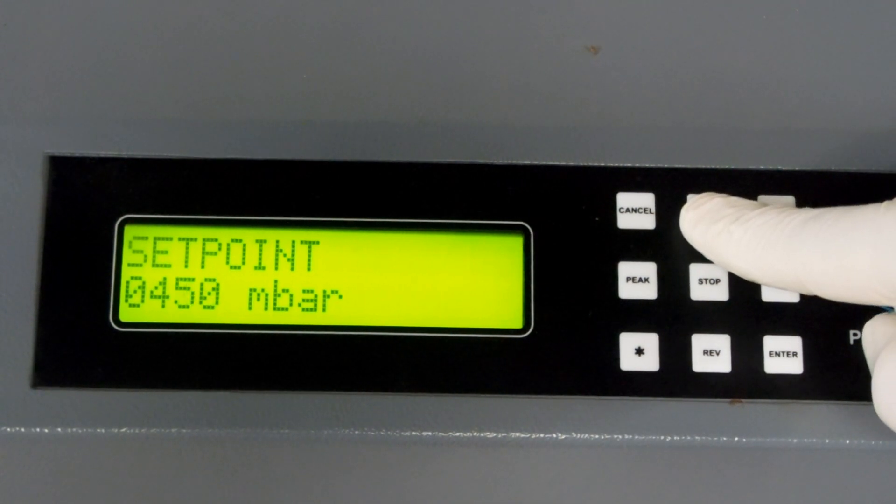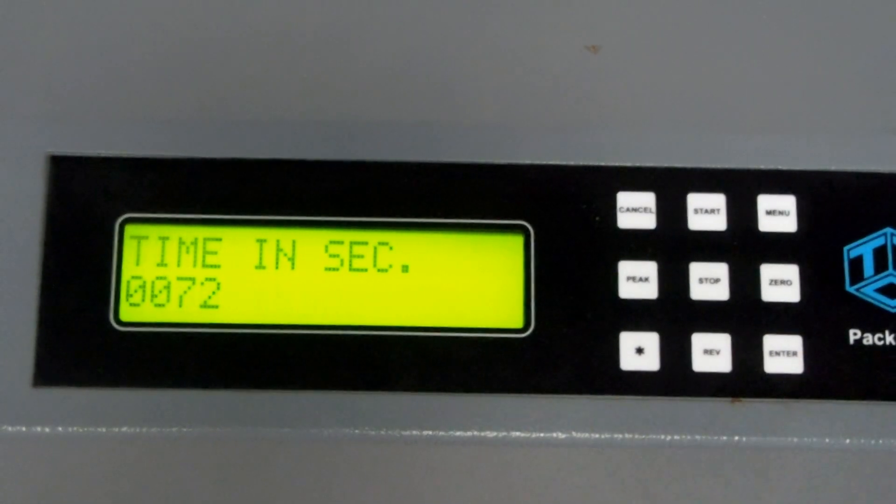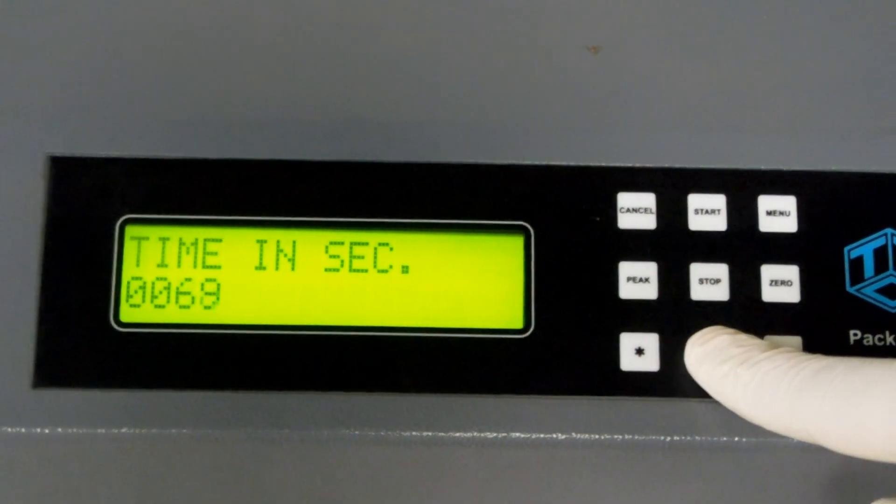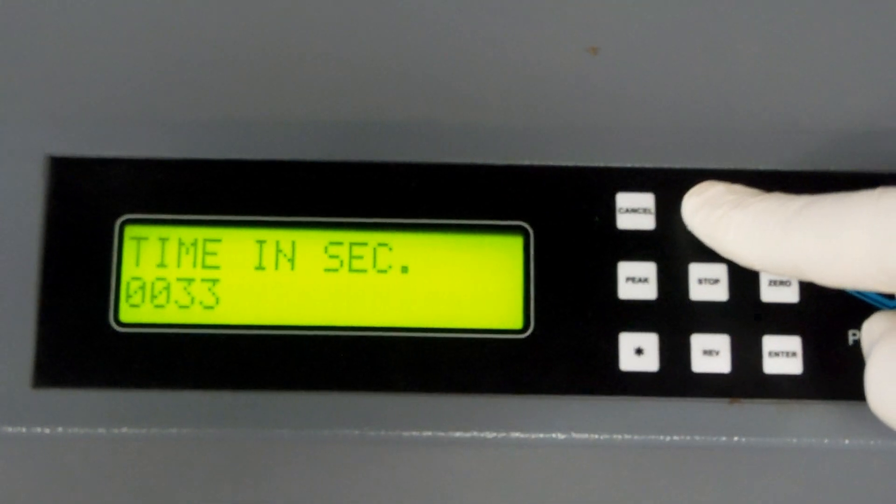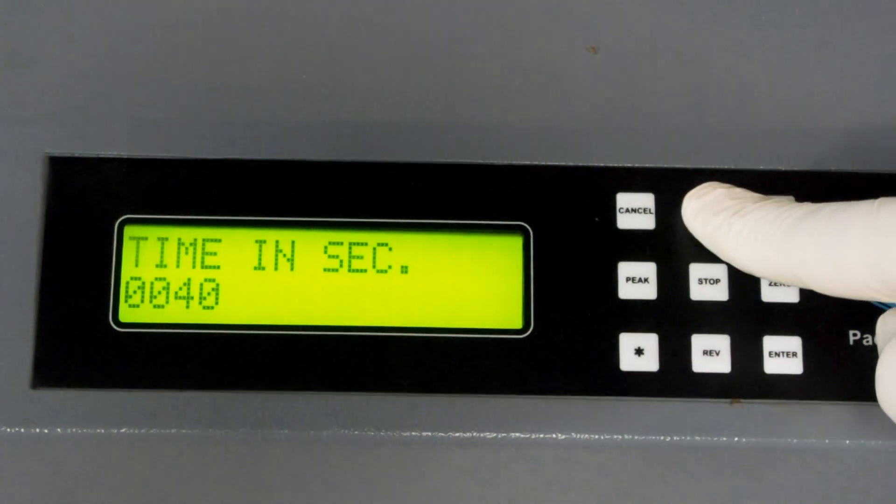Press enter to accept. This is the current time setpoint. You can change the current setting by using the start and reverse keys to increase and decrease the value.